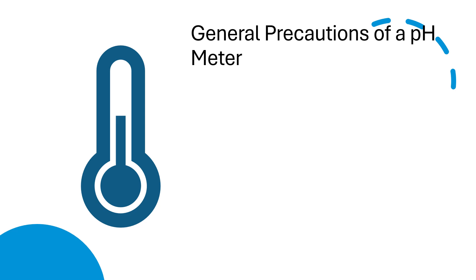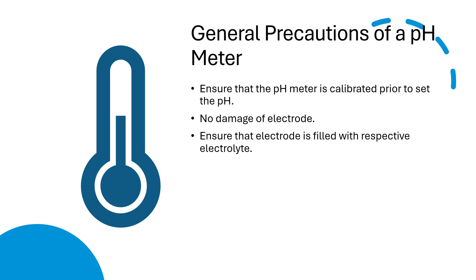Now let's discuss what precautions should be taken while handling the pH meter. Ensure that the pH meter is calibrated prior to adjusting the pH. Prior to taking or adjusting the pH, the pH meter should be calibrated. Check for no damage to the electrode. Check the electrode carefully prior to starting the measurement—there should not be any cracks. Ensure that the electrode is filled with respective electrode light. Generally, 3 molar KCl is used.